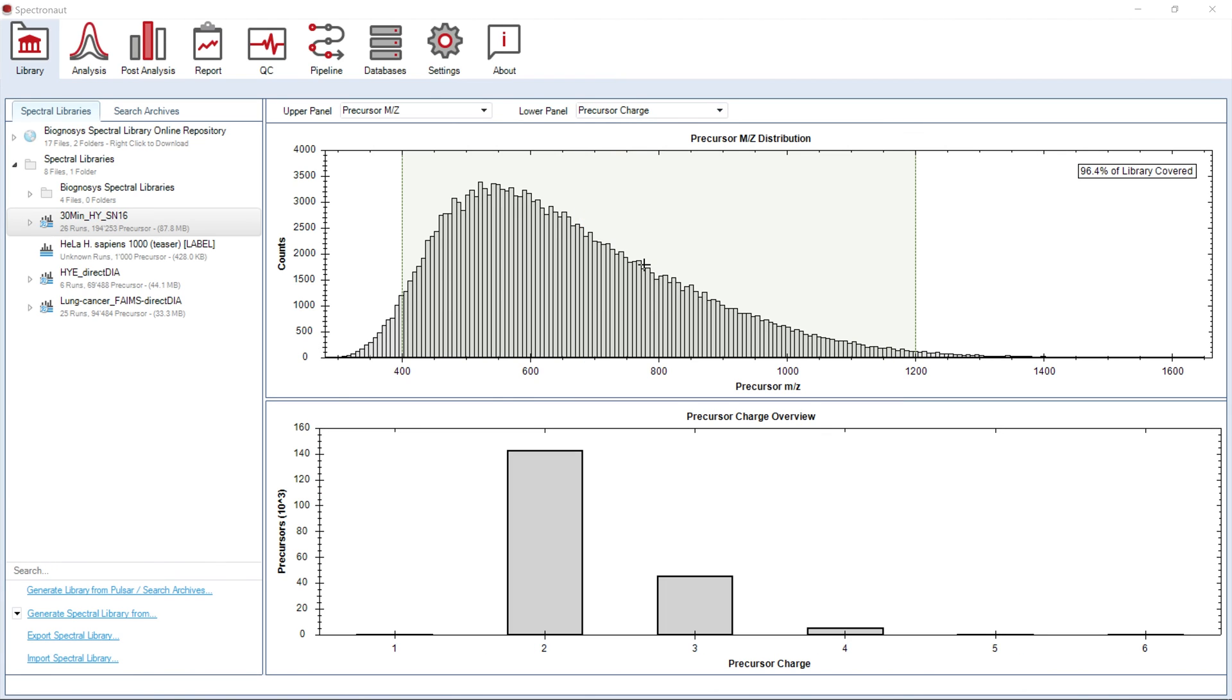To see detailed information on protein groups, precursors, and fragments included in the library, you can export the library in the TSV format over here.